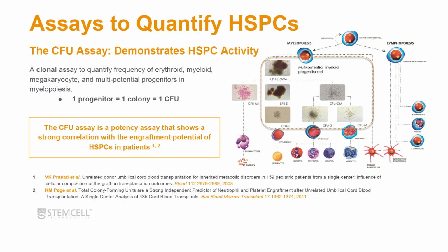And you can see that by the CFU-GEMM image shown here, where you see red cells as well as other cells surrounding it, versus the ability to look at more lineage-specific progenitors. For example, BFU-Es are from the erythroid lineage and CFU-GM from the myeloid lineage. And the ability to watch a single cell in semi-solid media expand and grow in culture in a spatially identifiable and separated way allows you to count and look at the frequency per cells plated, and whether I am getting the appropriate and normal erythroid and myeloid ratio, as well as platelets.